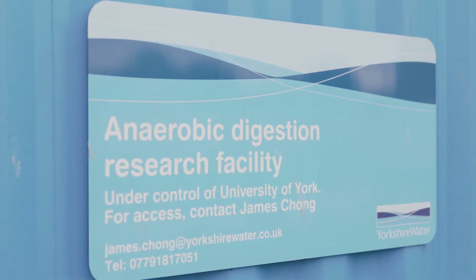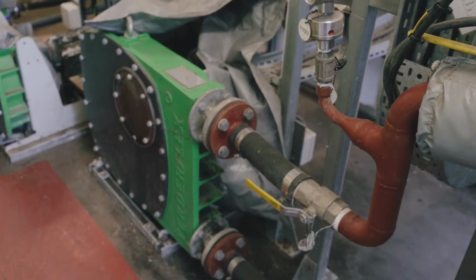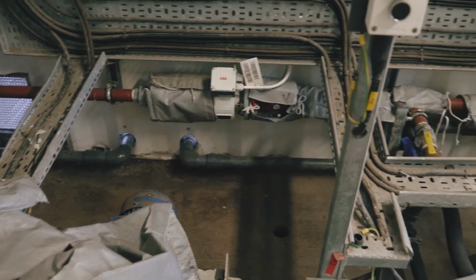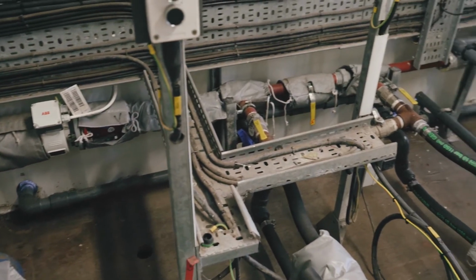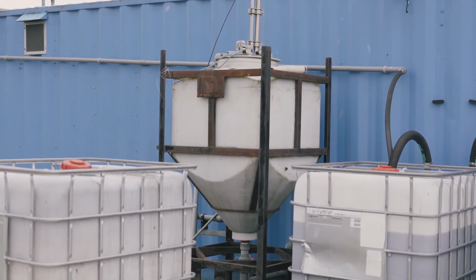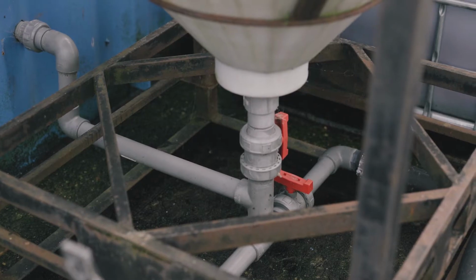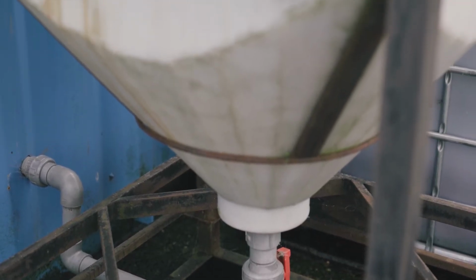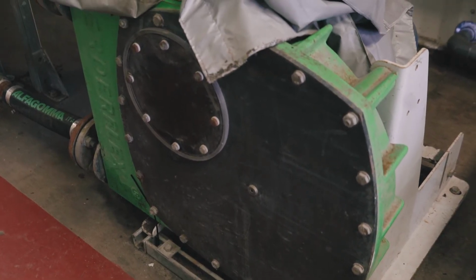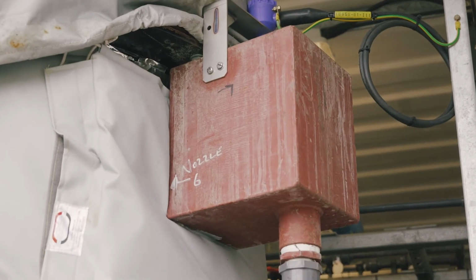The pilot rig is set up to mimic large-scale AD, so we have pumps that recirculate the material inside the vessel. Further up we have another pump that is used to recirculate the feed, so that's the hopper outside. What we don't want is for that material to settle before it gets into the tank, so periodically this basically stirs the tank outside. And then further down we have a pair of feed pumps, so that moves the feed from the hopper outside into the digesters.